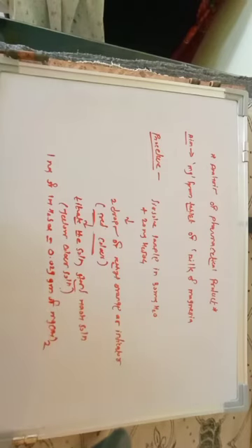Therefore we can write V1 minus V2 ml of 1 normal H2SO4 is equal to how much magnesium hydroxide. So what is your V1? V1 is the volume of H2SO4 added, that is the standard volume of a known concentration of H2SO4.